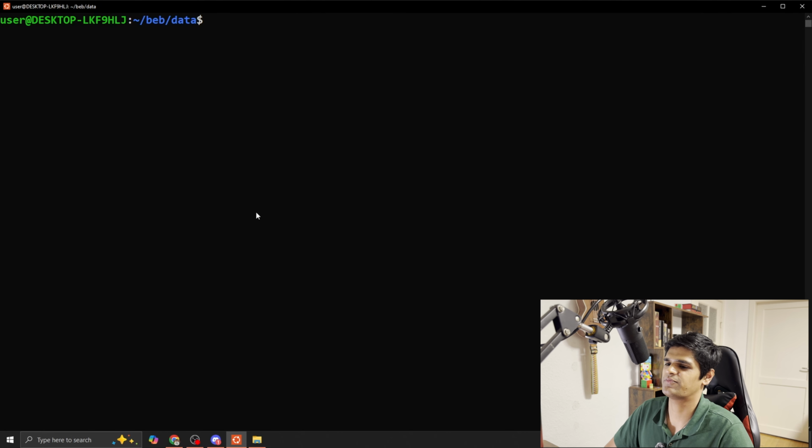Let's see the magic of pipes. So here is the thing. You have seen that we have created the lengths file, and then we were able to sort that file. And the thing is that if we want to see the output of the sorted file directly in one step, that's a bit difficult to do, because first we have to create the lengths file, and then we are sorting it. So you know what, we can do this in one command.